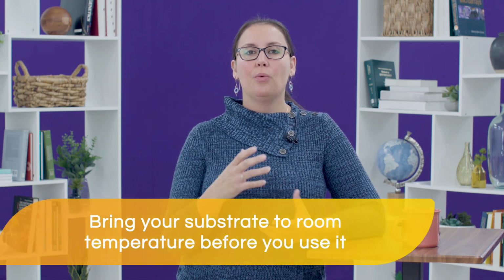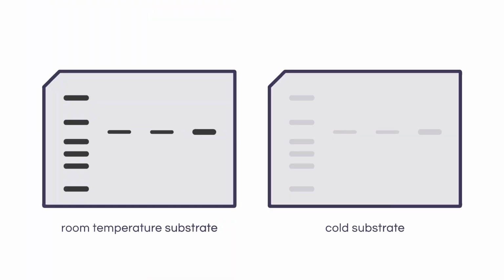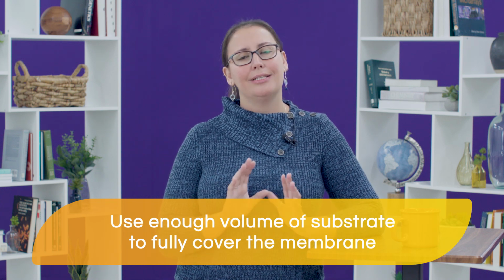If you store your substrate at 4 degrees Celsius, like it is recommended for several substrates, you want to bring it to room temperature before you use it. That's going to help ensure that that enzymatic reaction is happening at the same pace every time that you use that substrate. You also want to make sure that you use enough volume to fully cover the membrane. I know that substrates aren't cheap, but this is not where you want to try and save a couple bucks, because if you don't have enough substrate, that's going to influence the rate of that reaction and really compromise data accuracy.